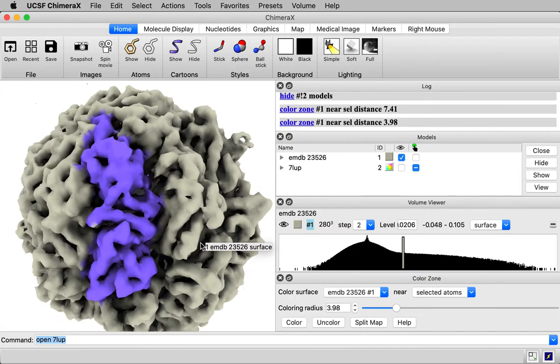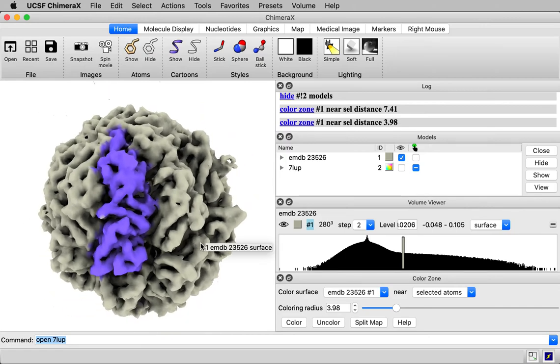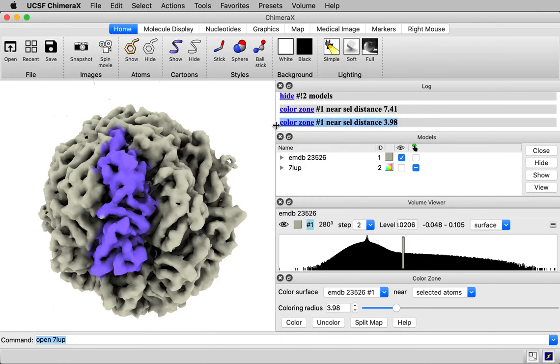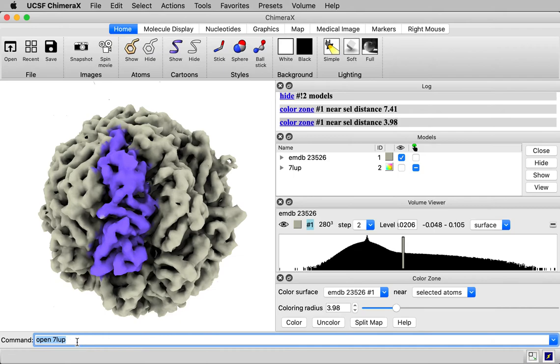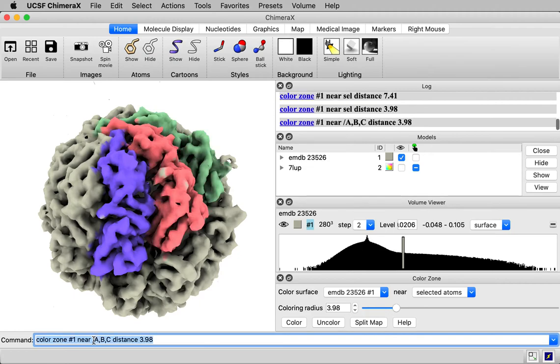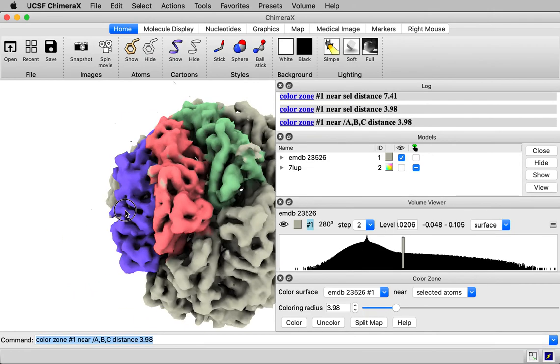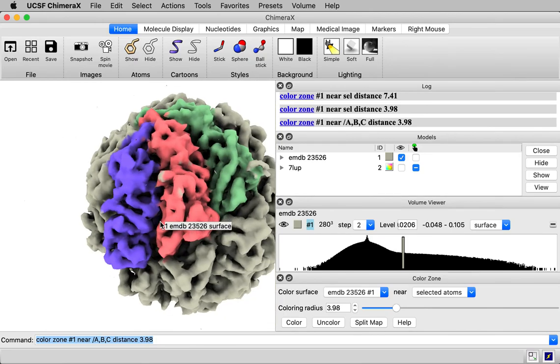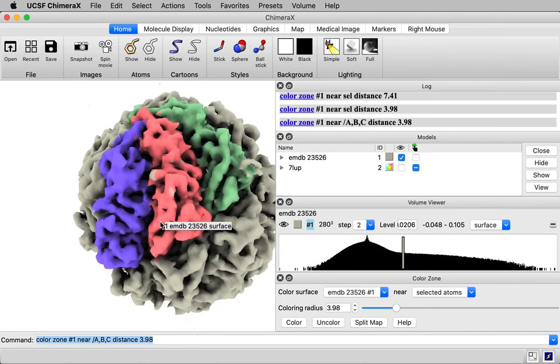Let me show you one more way to do it, the most powerful way to do this coloring. And that is to use a typed command. And you'll see in the log panel above, there's a color zone command. That's what that command was logged when we used this color zone panel. And just copy that command into the command line. And so color zone number one, that's the map near. It says selected atoms. That's what we just did. Let me replace selected. Suppose I want to color chains A, B, and C. I can say slash A, B, C, this distance range. And now we have all three proteins colored.